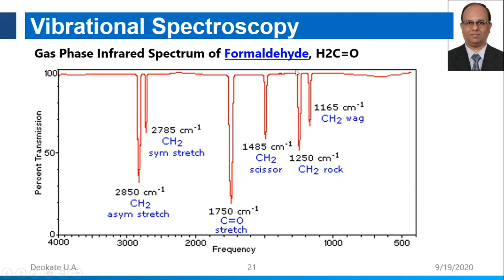Now, the position of peaks is constant for a particular functional group, but it also varies depending upon various factors which are responsible for the position of these peaks in the spectrum. You recall what we have learned in UV spectroscopy. In UV spectroscopy, we observe the lambda max, and the value of lambda max may shift towards the higher side or the lower side.